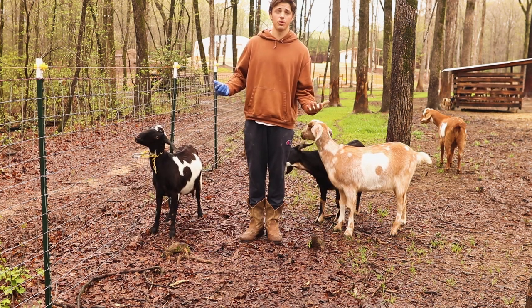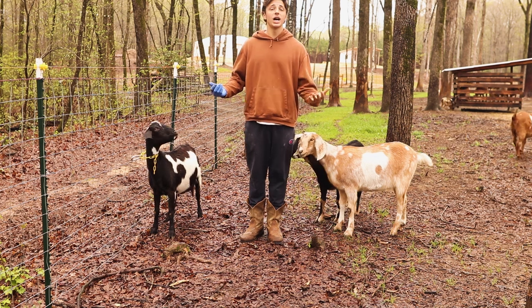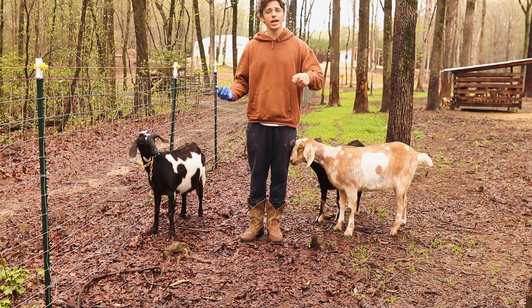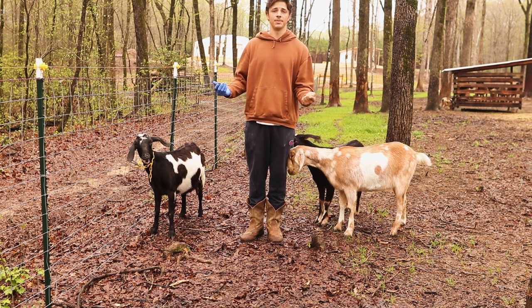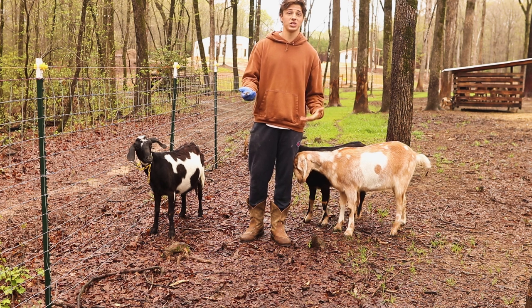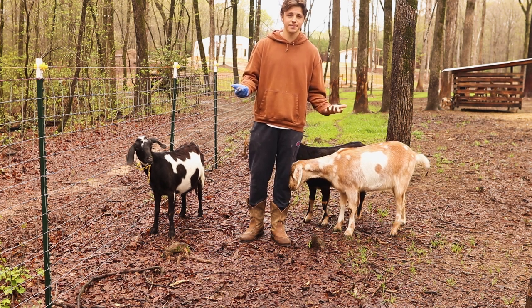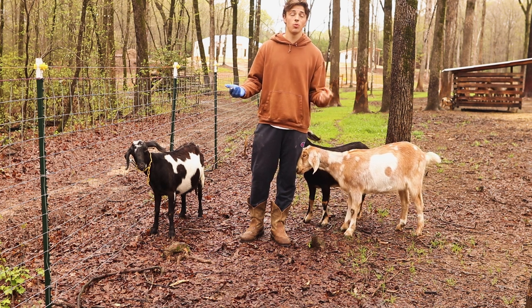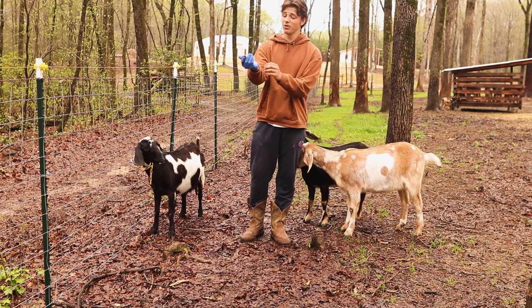Typically whenever you're getting a fecal sample, you want to get two pellets from the goat. That gives you enough sample to add the solution, strain everything, and still have enough for the parasites to rise and be able to test them. With Wanda, the poop I just got is a little bit mushy, which is also another sign of parasites. What I'm going for is about two grams of poop — one pellet is roughly about one gram.